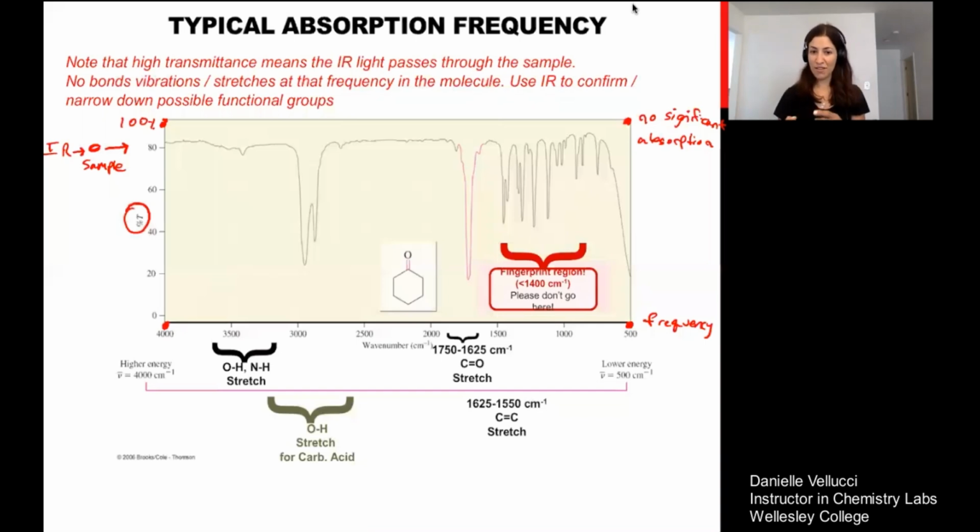And you will be looking at each particular wavelength: do I see high transmittance, or do I see what I see here, where the transmittance drops well below 50%, indicating absorption of light.